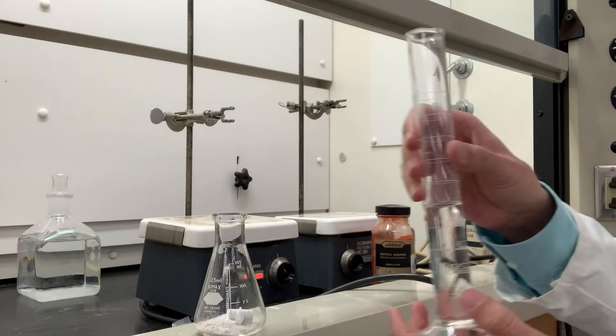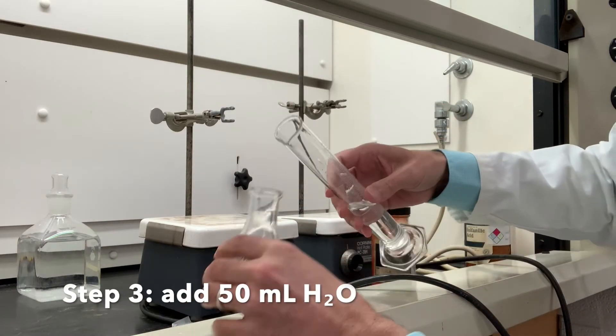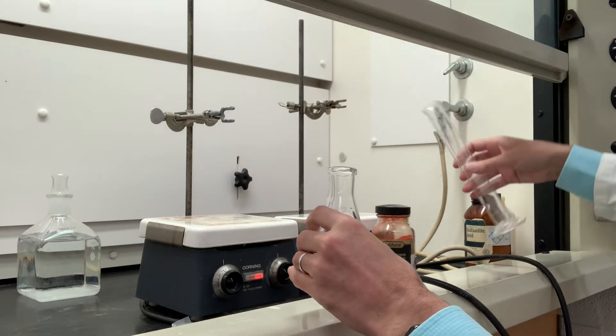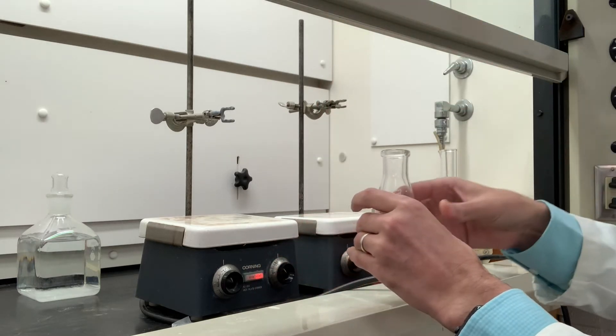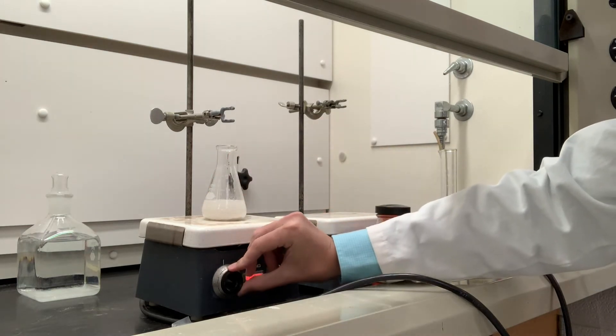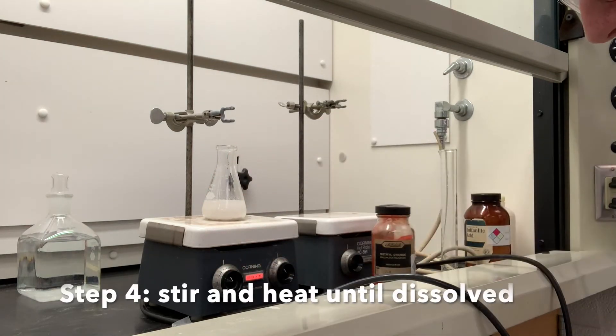Then we want to add 50 milliliters of water. This is distilled water. We'll heat that on a hot plate with stirring until it dissolves. This is part one.